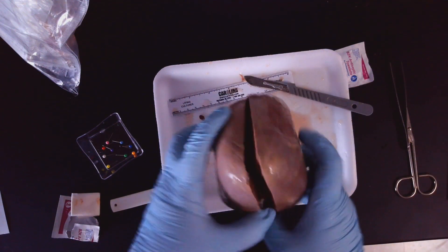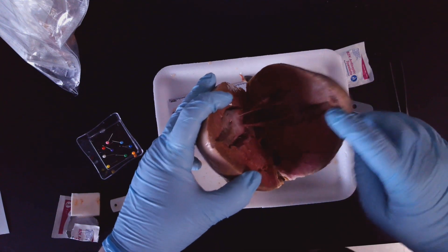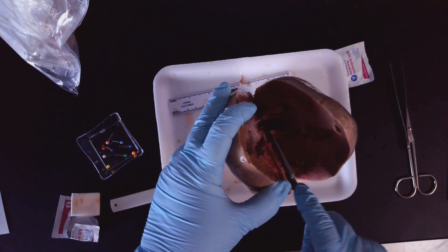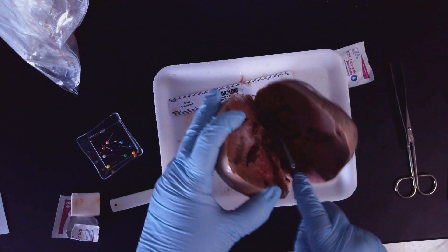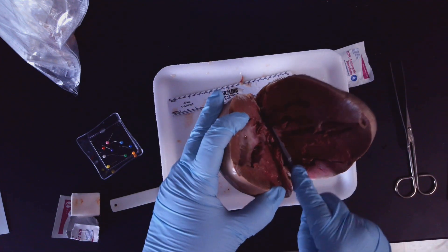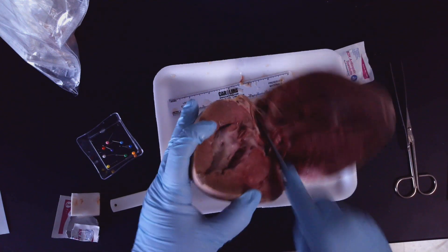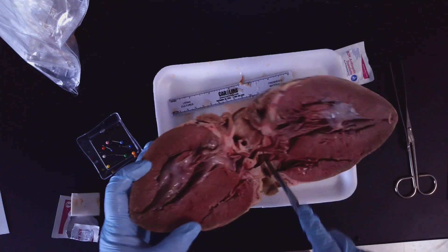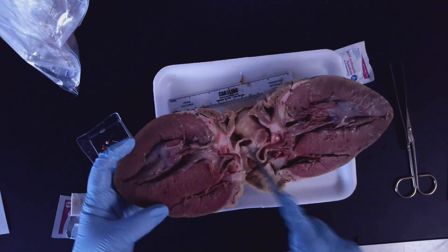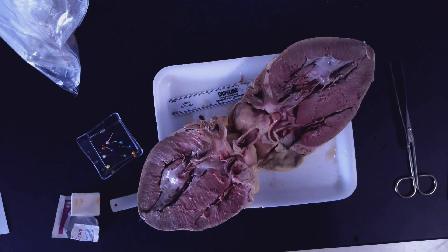Because what I want to do is this — open up the heart. So now it's kind of starting to fall away. So what I'm going to do is go in here, kind of slice at those things that are keeping it from opening. Slice it down like this. And there we go.